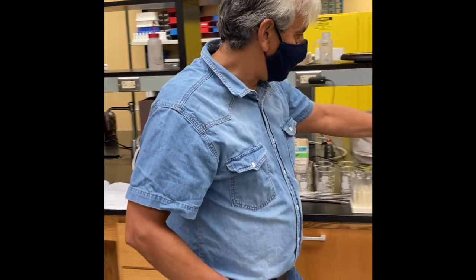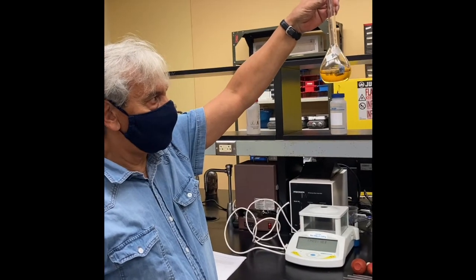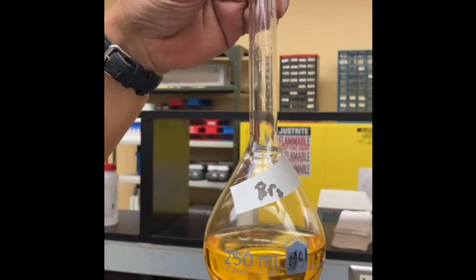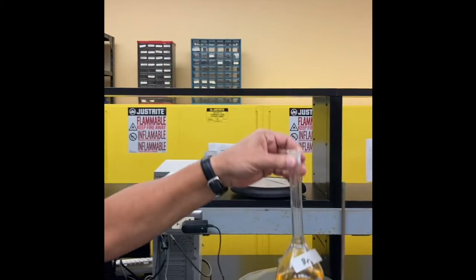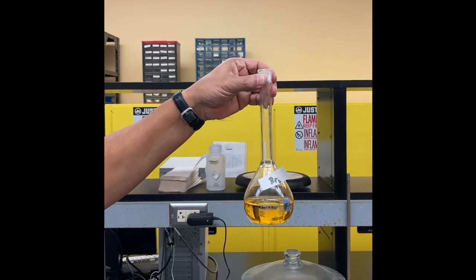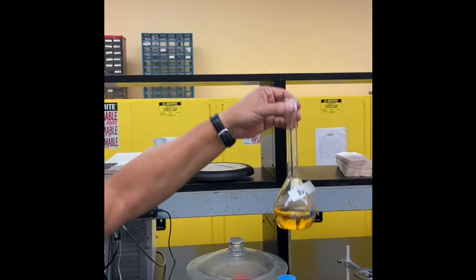How will we see that the reaction takes place? You can see that bromine solution has a characteristic yellow-brownish color. Once bromine is consumed in the reaction, the solution will lose its color and become transparent. So when the reaction is complete, the yellow color is fully gone.